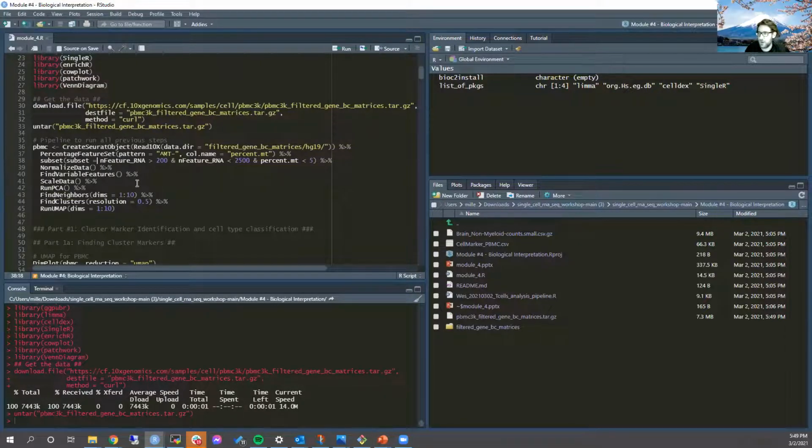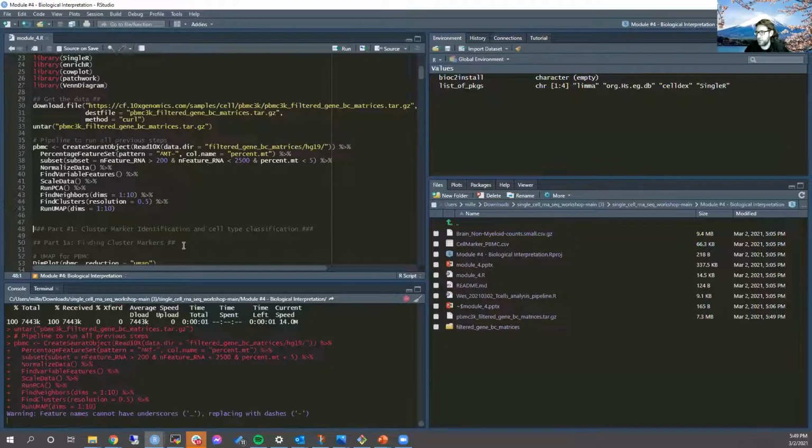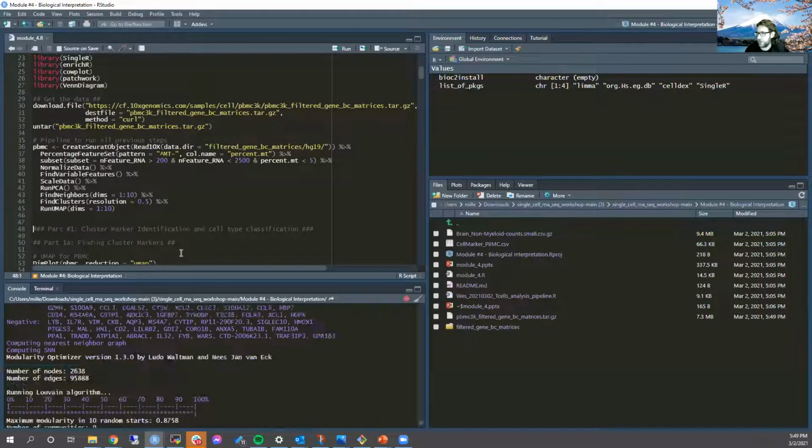So what took us 3 weeks to learn, we can accomplish in less than 10 lines of R code. In fact, depending on how you think about it, it's actually just 1 line of R code. Pretty cool. You can put your cursor anywhere here and hit Control Enter or Command Enter, and it will just run the whole thing. And there it goes. Pretty fast.